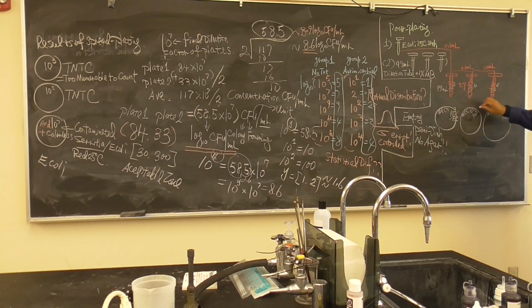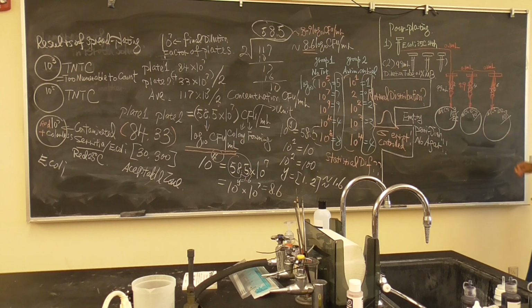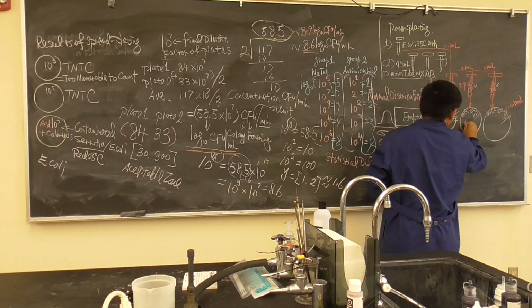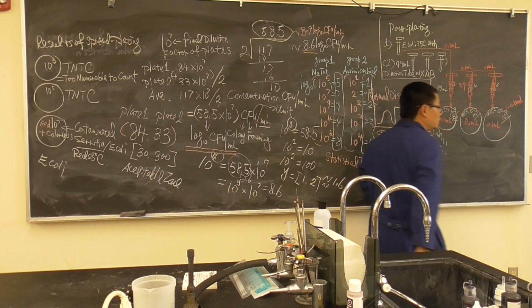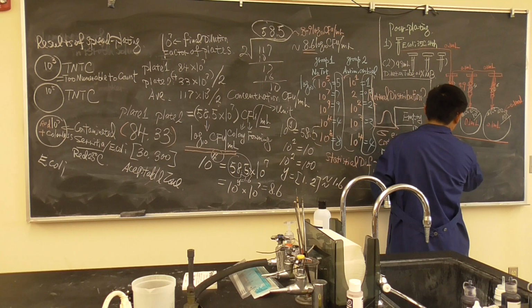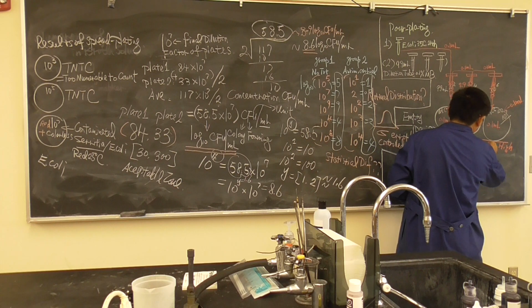Now remember, this dilution factor will be 10 times higher than the tube dilution. The reason is we are adding 0.1 ml onto it. Okay, what's the difference? To these empty petri dishes, we first add 0.1 ml from tube number 1, 0.1 ml from tube number 2, 0.1 ml from tube number 3. Same thing, only one pipette tip from high to lowest dilution. So this is low, this is high dilution, only one tip.